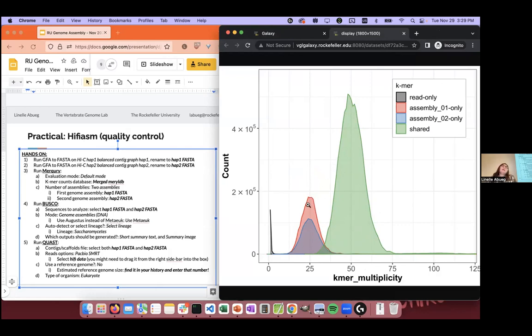Yeah, and this is kind of what a heterogametic one would look like. I'm not sure what the difference is in this yeast. I don't know yeast sex chromosomes. But for our real data, this is what our XY animals or our ZW birds end up looking like. If it's XX or ZZ, then this is basically just the same mirrored peak.